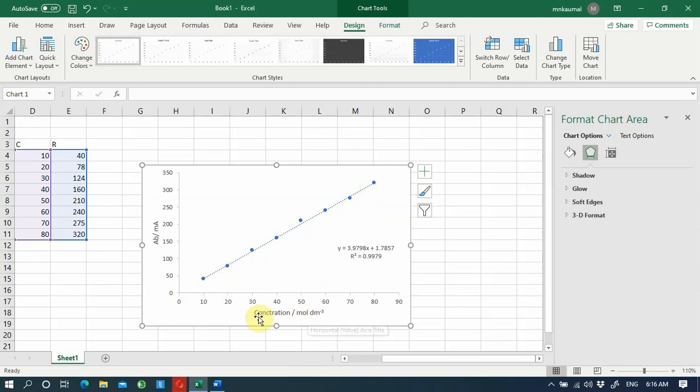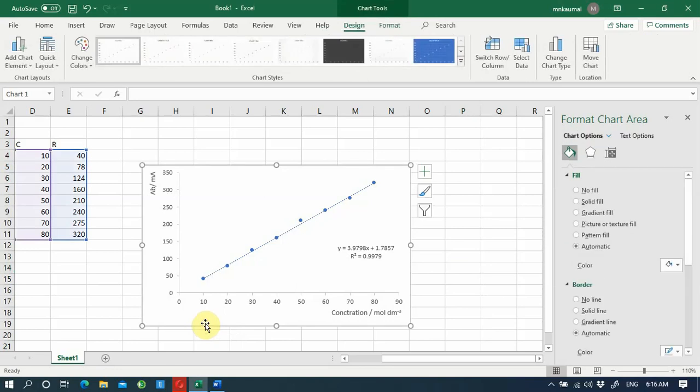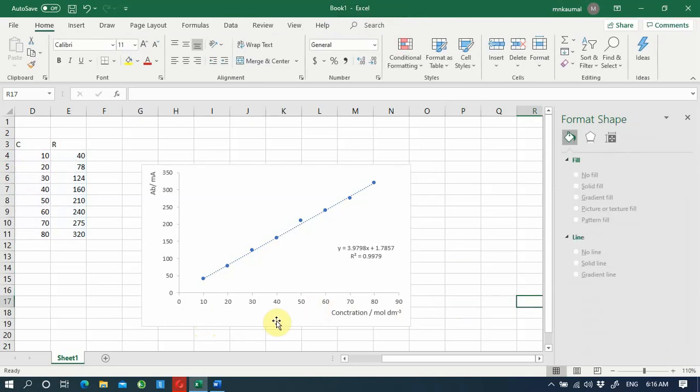Have the units, label axes. If you want to move it, you can still do that. You can just move these axes here. So I put this milliampere just to show you, but again, that's something you can do. Now this is a really good graph. If you want to move this to a Word document, you can do it easily.